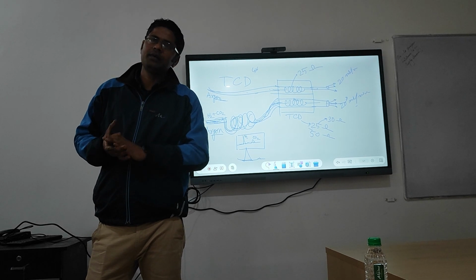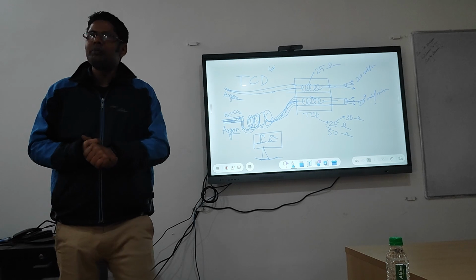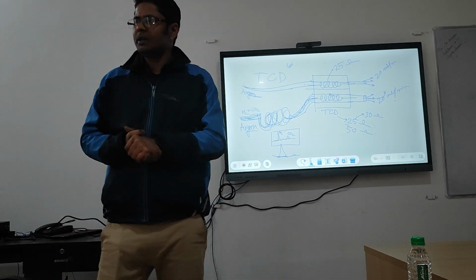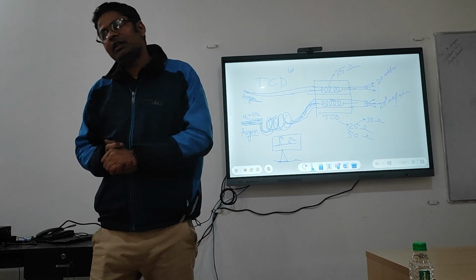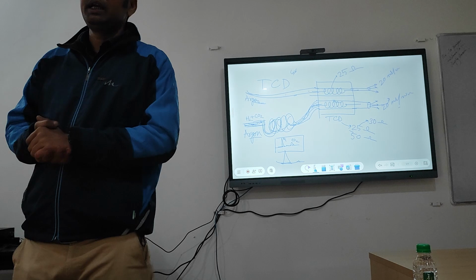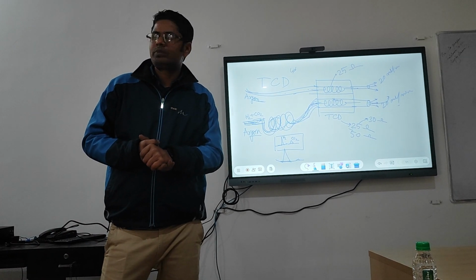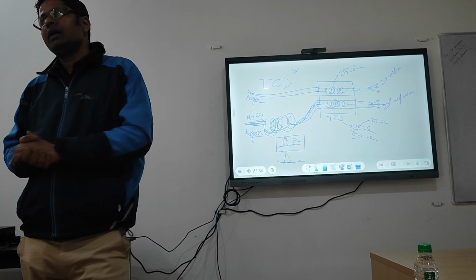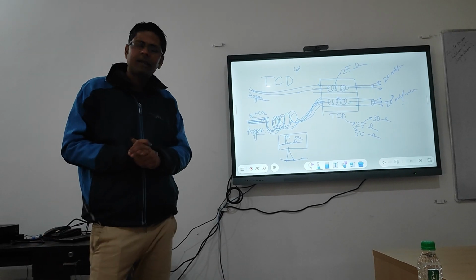In GC we can use 4 types of carrier gas. Hydrogen is sometimes used as a carrier gas. It's a little bit risky, so it's only sometimes used. The other 3 gases are widely used: helium, nitrogen, argon. These 3 gases are widely used as carrier gas in gas chromatography. And hydrogen is also sometimes used as a carrier gas, in very special cases.